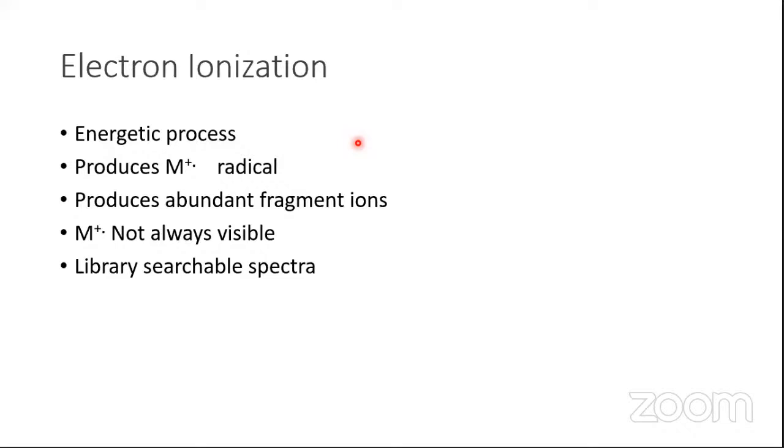And that is why there are commercial libraries available for GCMS, which have more than 3 lakhs of organic compounds and their spectra stored. One can use this library whenever working with GCMS. This library is in the form of a database on every GCMS supplied to any user, and it can be seen along with the compound spectra, and then you can identify the compound, or at least the library will help you come closer to the structure of your compound. So it will assist you in getting structural information.